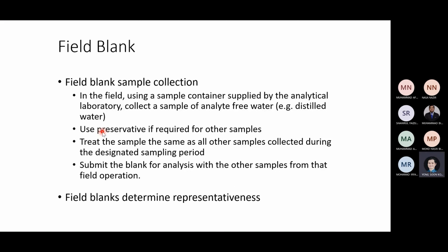So why is this? Now this one is completely different. The reason for determining this field blank is to see the conditions during that time, which includes the influence of air also. They want to see what conditions in the field might influence the quality of your distilled water, and hence also your water sample. So they are a little bit different. It looks similar but slightly different.